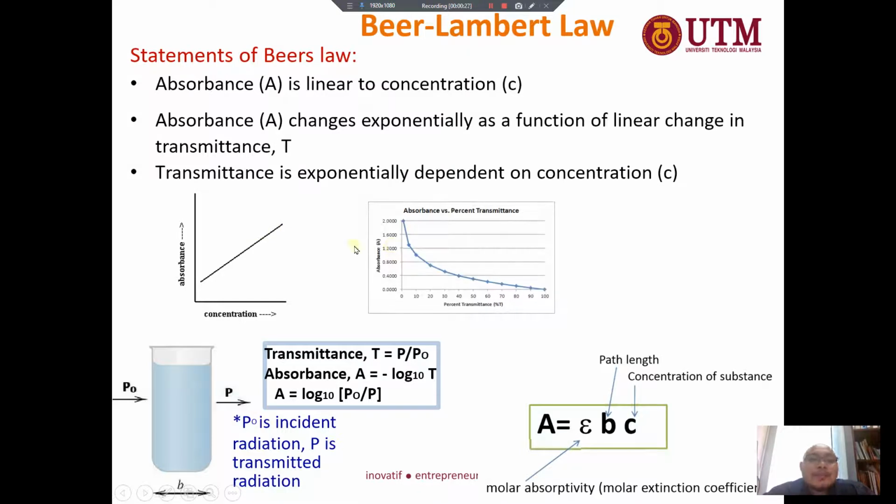The next one: absorbance changes exponentially as a function of the linear change in the transmittance.